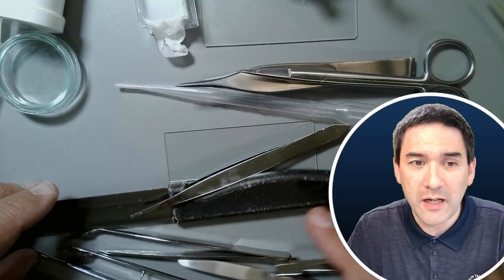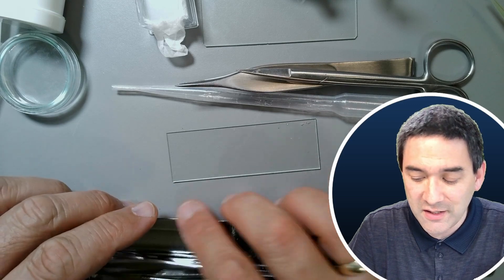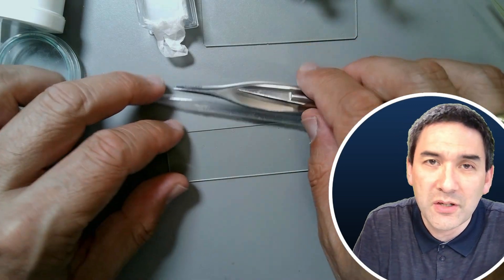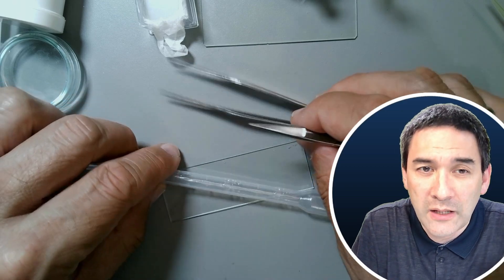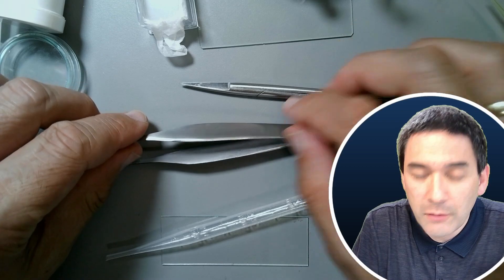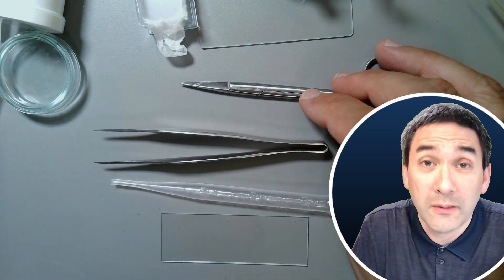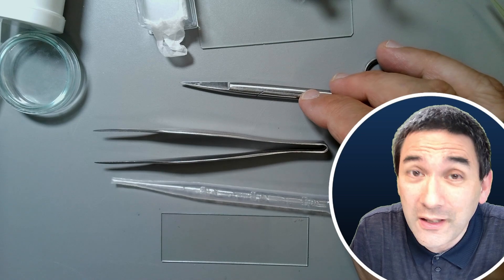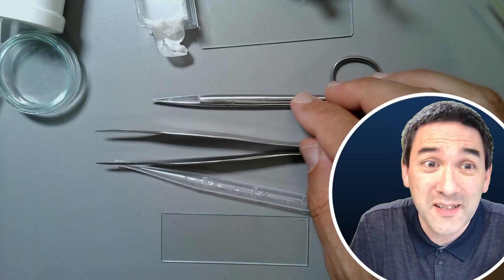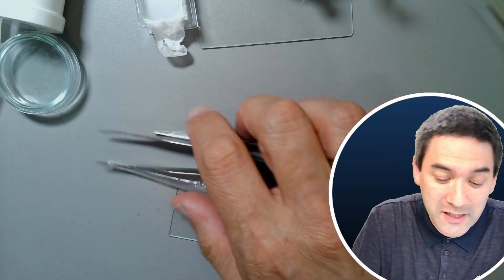All of the others I just basically keep in my drawer in case I need them, but in most cases they're not needed. Where can you get those things? Sometimes there are dissection kits you can buy online, or otherwise you just buy them individually. They're not that expensive. They're made of stainless steel and these tools I've had for over 30 years already. I got them when I started to study at university as dissection tools. I'm still using them over 30 years later. Let's move on.